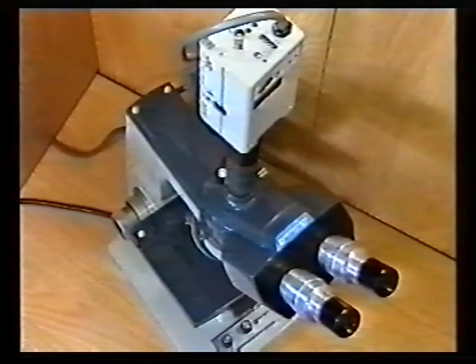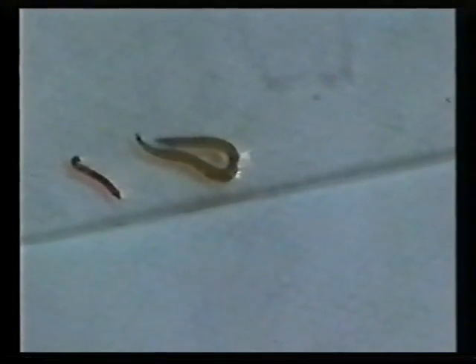If you can afford it, you could purchase a camera that sits on top of the microscope. You can then view your specimen much easier on a television monitor. In addition, you could add a video recorder and tape your results for future reference, adding later results to the same tape. You could eventually assemble your very own parasite collection.